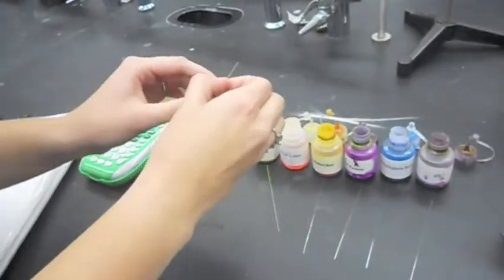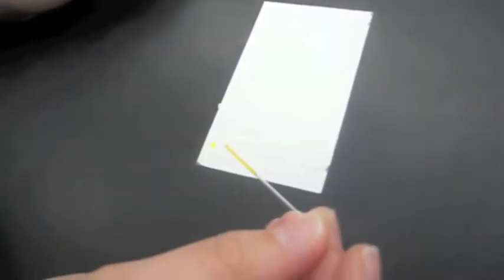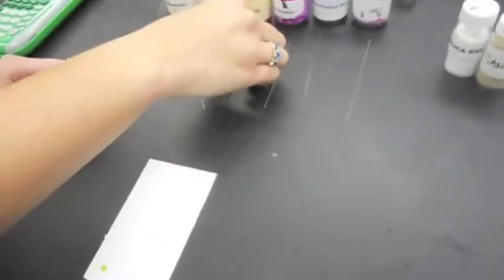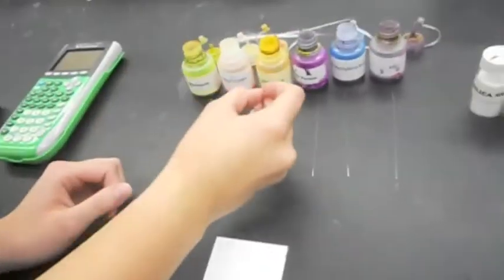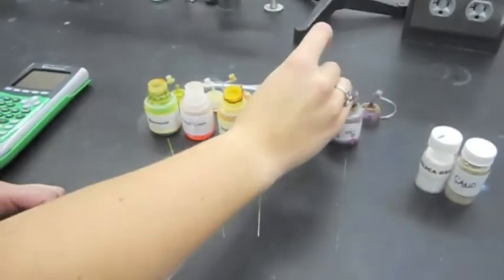Pick up your next capillary tube. Make sure the dots are small and evenly spaced. Do it straight up and down.